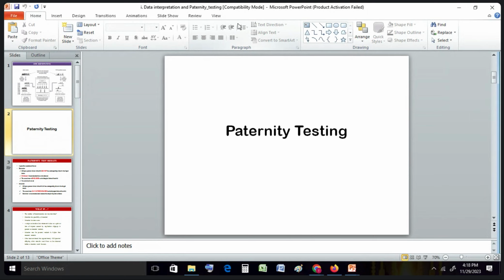আলাপ মনে হয় করেছিলাম, বলো দেখি করা যাবে কিনা। স্যার এখানে তো স্যার বায়োলজিক্যাল ফাদার তো মনে হয় স্যার, মানে স্যার বায়োলজিক্যাল ফাদারের কথা কি বলতেছেন স্যার, নাকি মানে বাবা মা দুইজনের কথা? I am saying about the parents. যে কোনো একটা, you are getting a baby out of nowhere, like no clue of its parents. Can you identify the parents of that baby by doing the DNA fingerprinting and matching the result within the database?